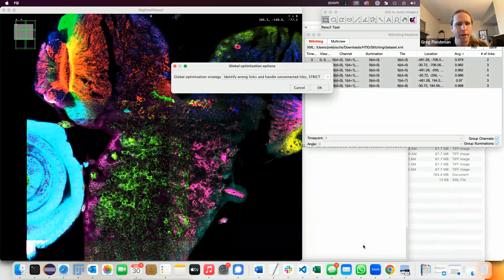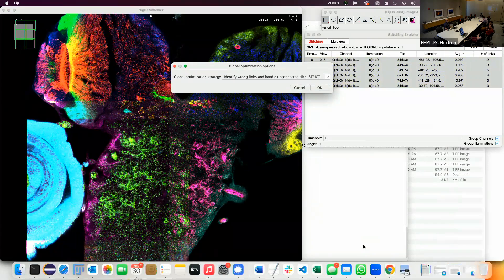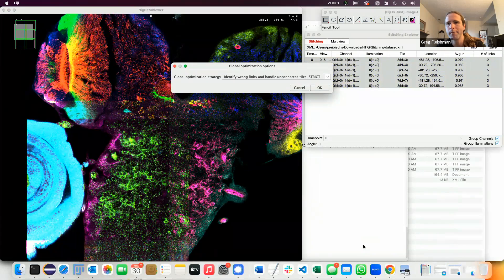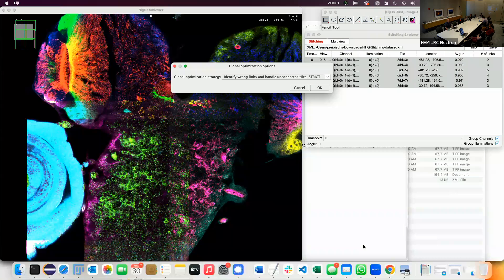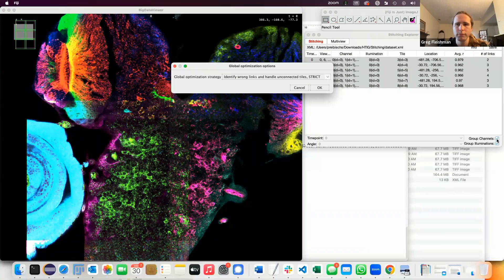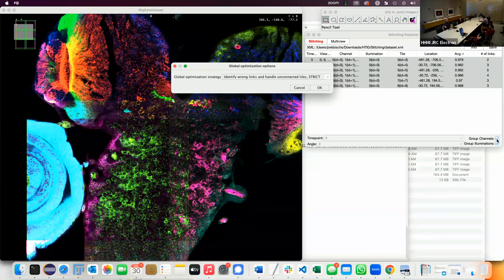Question: does averaging compute alignments separately for each channel and average them, or combine image data? It averages the image data. If you want, you can compute each alignment for each channel separately — click down here, channels are grouped by default, you can ungroup them. Usually we do stitching first to get in a good spot, even if there's some channel misregistration, then we do an interest-point-based second step that solves small issues — with affine rather than just translation.